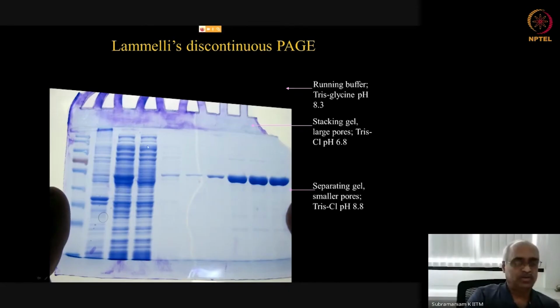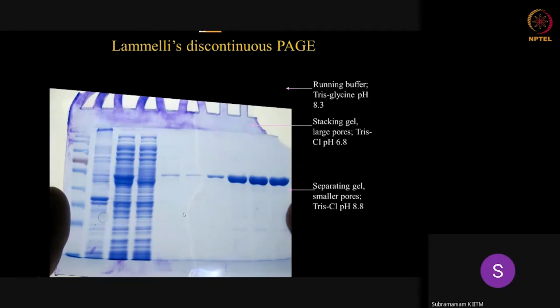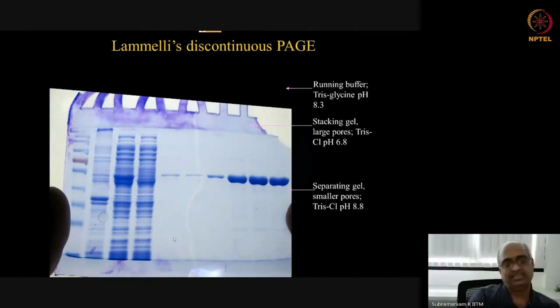So if you look at this gel, you probably will be able to count about 100 bands in this. So it's in the order of hundreds. So maximum, if you increase the length of the gel some more and allow more theoretical plates, and increase the percentage and so on, and when you increase the resolution, probably you can go to 300 to 400 bands, and that itself is a stretch. Normally it is under 200 bands that are identifiable.